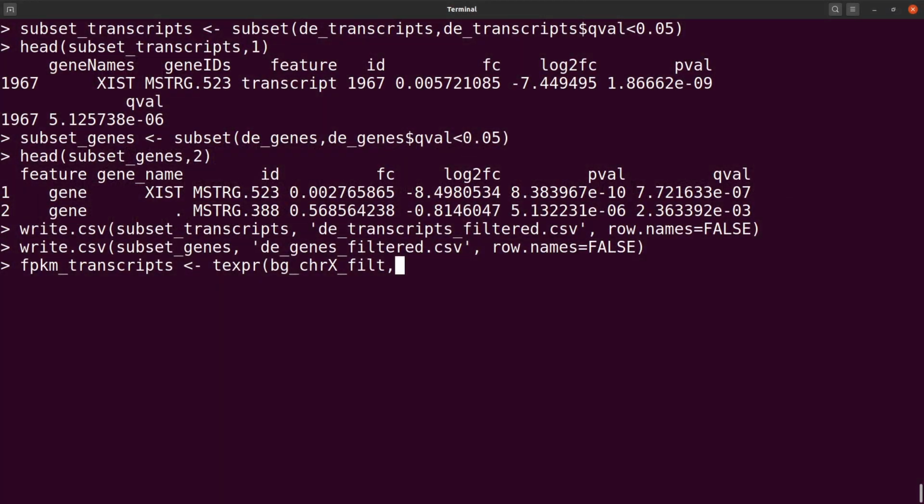Now I also want to get additional information. So let me just say I want all the information in that particular object for the transcript. So I will say all like this, and then I will just execute this command. So now I have them.